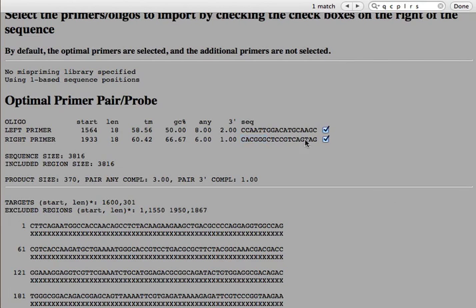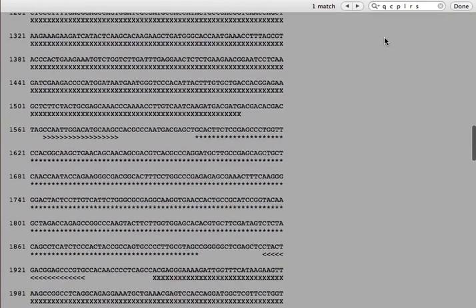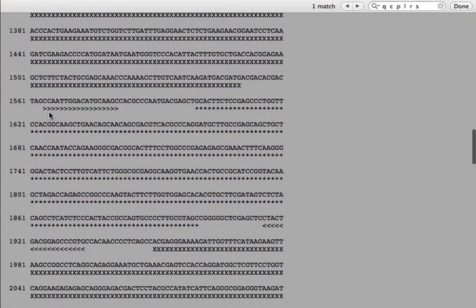It is not your DNA for the right primer. But completely different story for the left primer. Notice this sequence. Here, we'll just take the first. This is actually relatively easy because it's doubled. CC, AA, TT. So cat, essentially. Now let's scroll down and see our primer sequence. There it is. It's CC, AA, TT. So it is the exact same sequence as the primer.